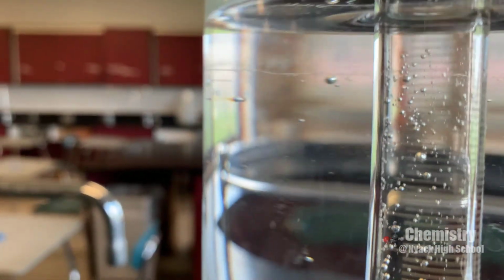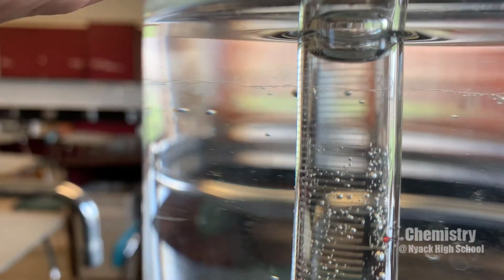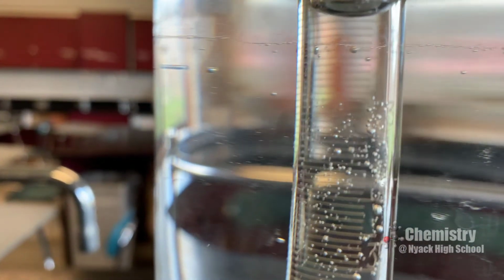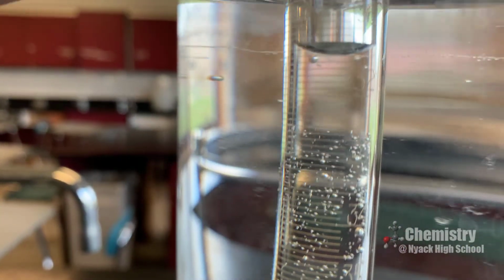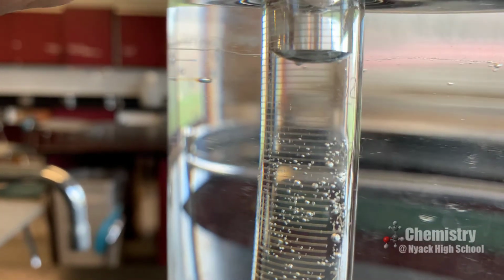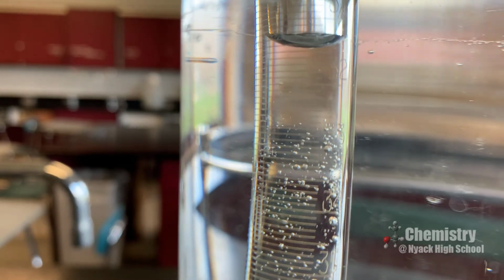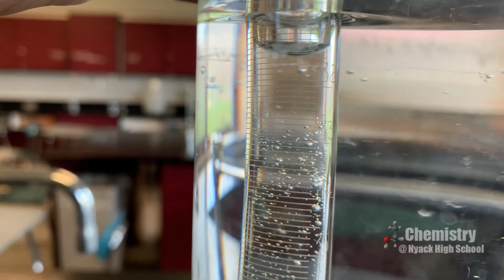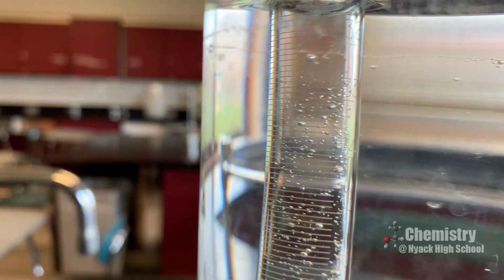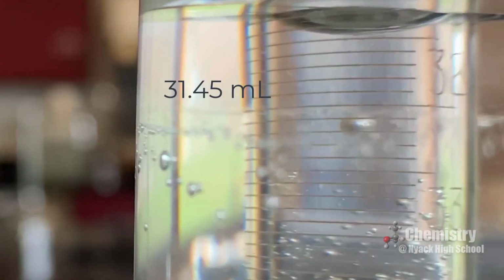So I'm going to read the eudiometer very carefully. It's really hard to read that. It looks to be about 32. Sorry, let me get that closer up. The measurement looks to be about 31.45 milliliters.